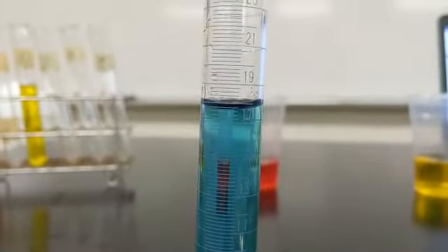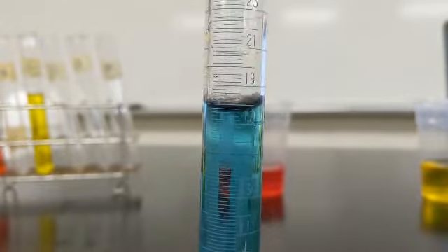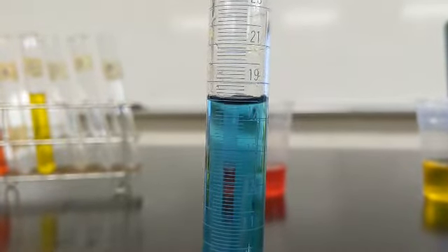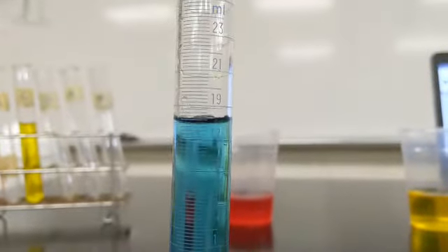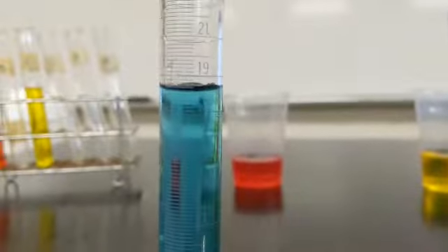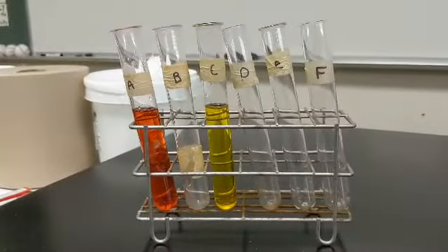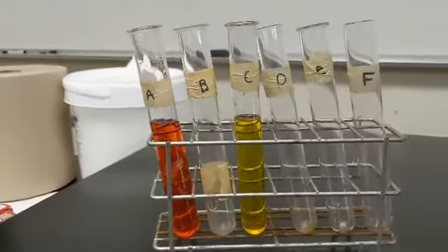A little bit more. See, I'm adding it with the pipette, one drop at a time. There we go. Okay, and that's going to go into test tube E. Okay, here we go.